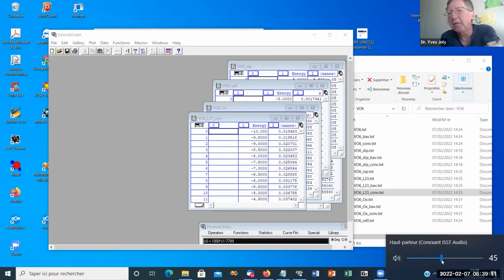In the end, the cutting energy, or the true Fermi level of the excited state, is not well known. So I left this possibility to calculate transitions toward possibly occupied states, because sometimes they are not completely fully occupied.